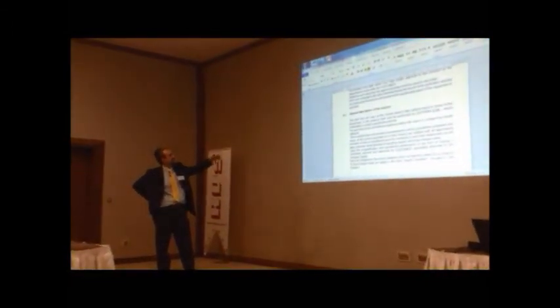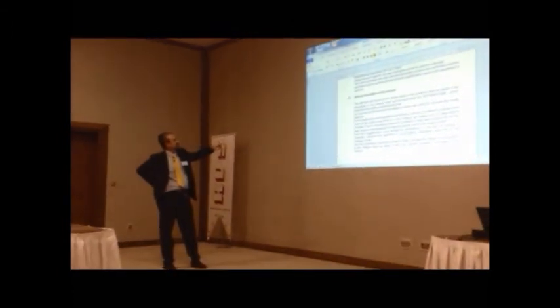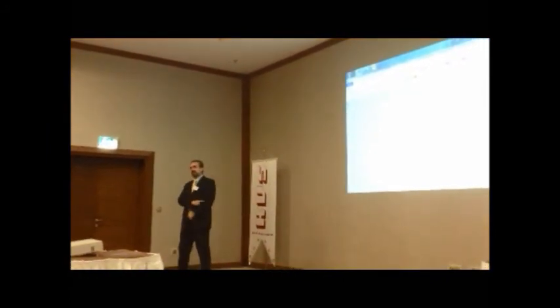General description of the process, and so on. Any non-compliance found that does not meet the criteria of acceptance of this protocol shall be stated in the report deviation form that we put in this protocol.